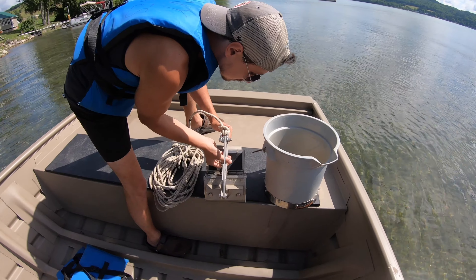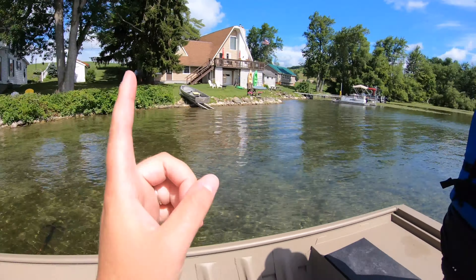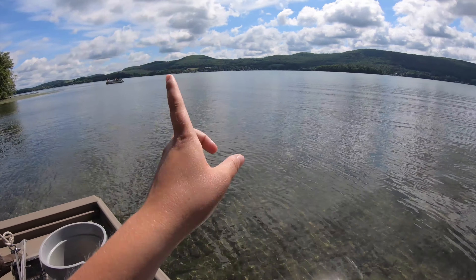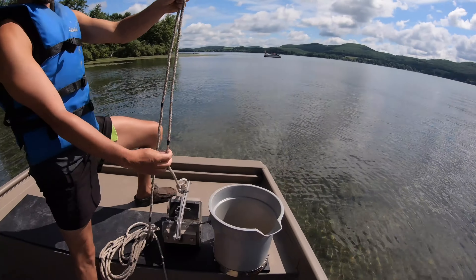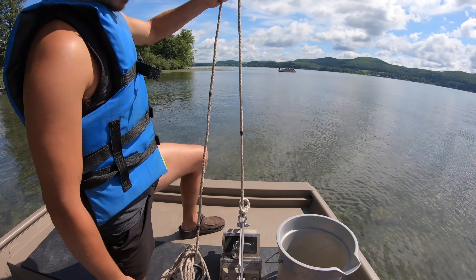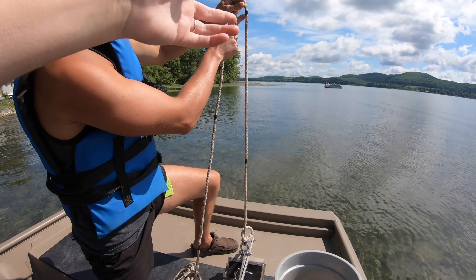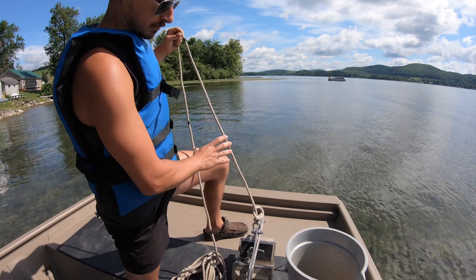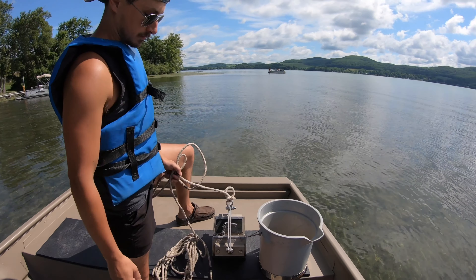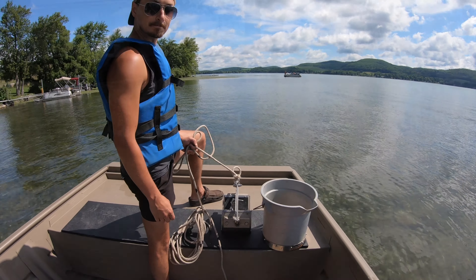We're going to do a few of these grabs: shore, 0.5 meter, 1 meter, 1.5 meter, 2 meter, and 3 meter — about six samples for everyone to go through. The depth markings on the ponar grab line are in half meters. We also use a depth finder to help us out so we're not running all over the place.